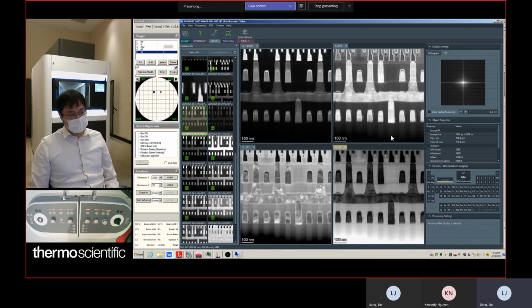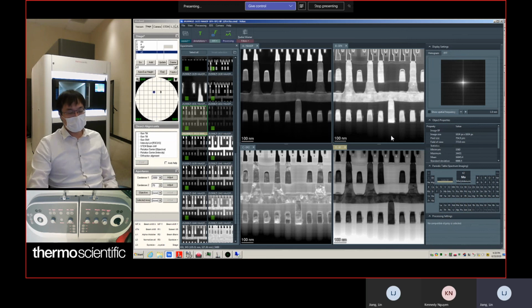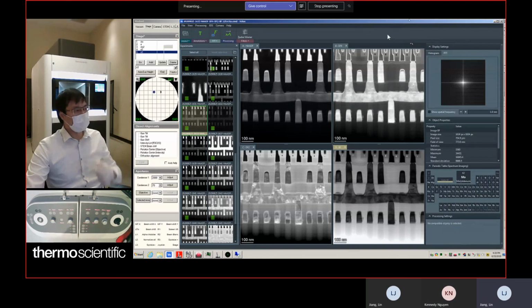I don't want to spend so much time using Z, because the Z button is a little bit harder to control compared to the focusing knob. If you use the focusing knob, the probe becomes a little bigger and that affects resolution, but at lower magnification it's hard to tell. It almost makes no difference. So that's the reason I'm just using the focus knob. Also, the focus value is not that big. Just makes it easy to do.